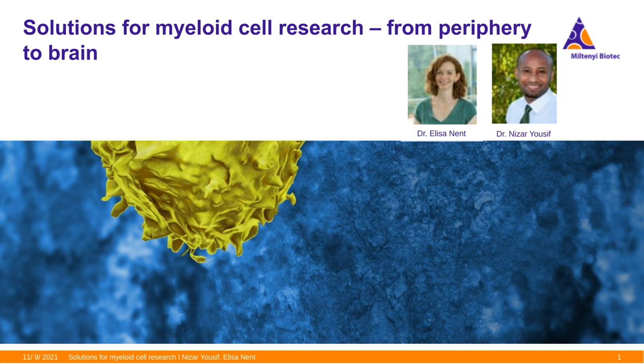Great, thank you. Next question. What are potential other downstream applications of the isolated cells? In case of microglia, after you isolate them from the brain, what I showed mainly was cell culturing. But you can, of course, also go for other applications, such as single cell sequencing.